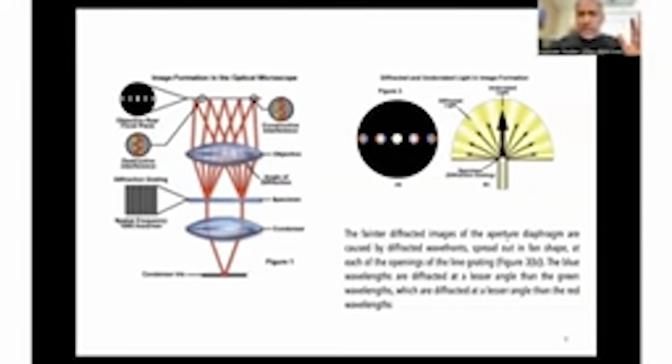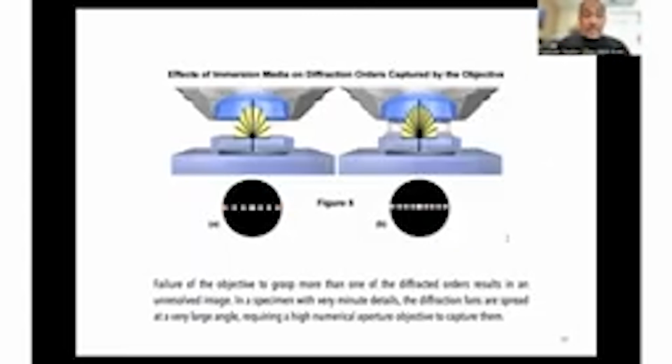So I'm not going to get into the details of how diffraction works. And if you're curious, go read a little bit about it. The critical thing for you to remember here is that the extent of diffraction that happens is going to determine the nature of the image that you're going to be able to visualize. Okay, so this makes a difference also in how much light is able to get into the objective that allows you to now see things very well, right?